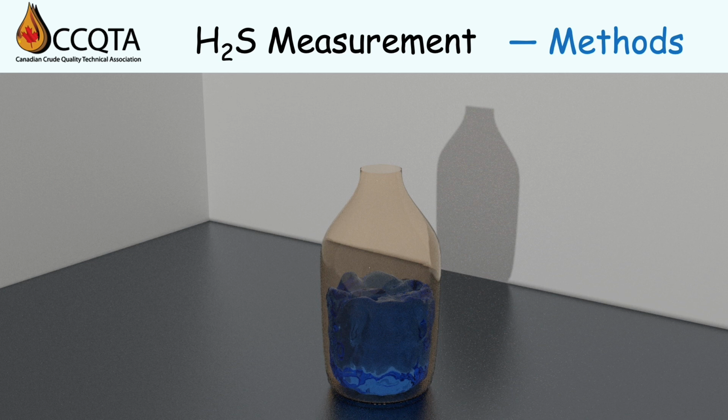Next, since the H2S content of the vapor space is typically unknown when taking the measurement, it's possible that the H2S level is off scale for the first detection tube. In that case, another tube or tubes need to be used and a further 100 ml of headspace vapor needs to be sampled. That leads to dilution of the headspace and a reduced apparent H2S content. Lastly, this method reports the vapor space concentration under specific vapor-liquid conditions of 1:1. The vapor phase of H2S under these conditions cannot be easily translated to other vapor-liquid conditions. I'll explain this in a little more detail later.